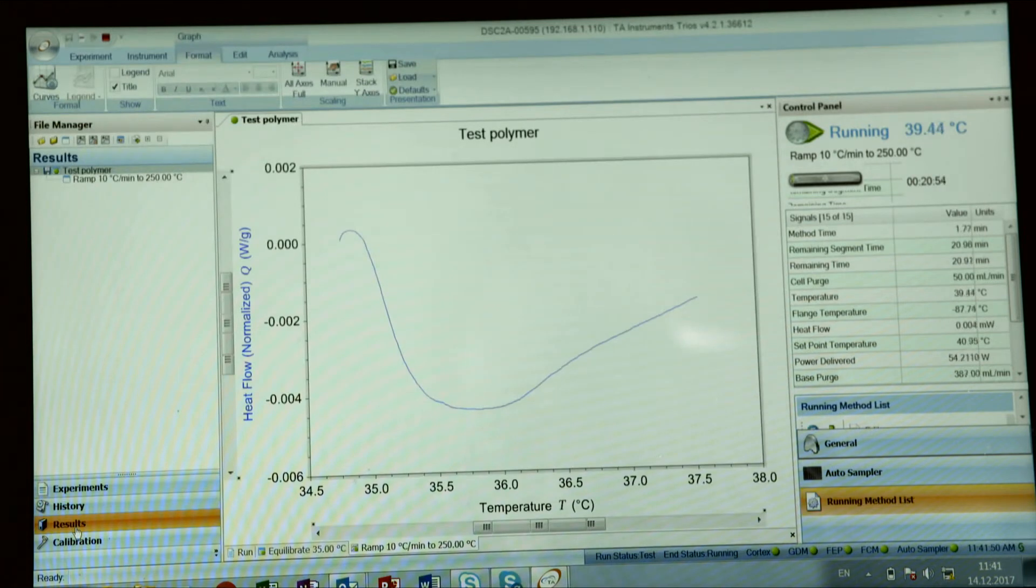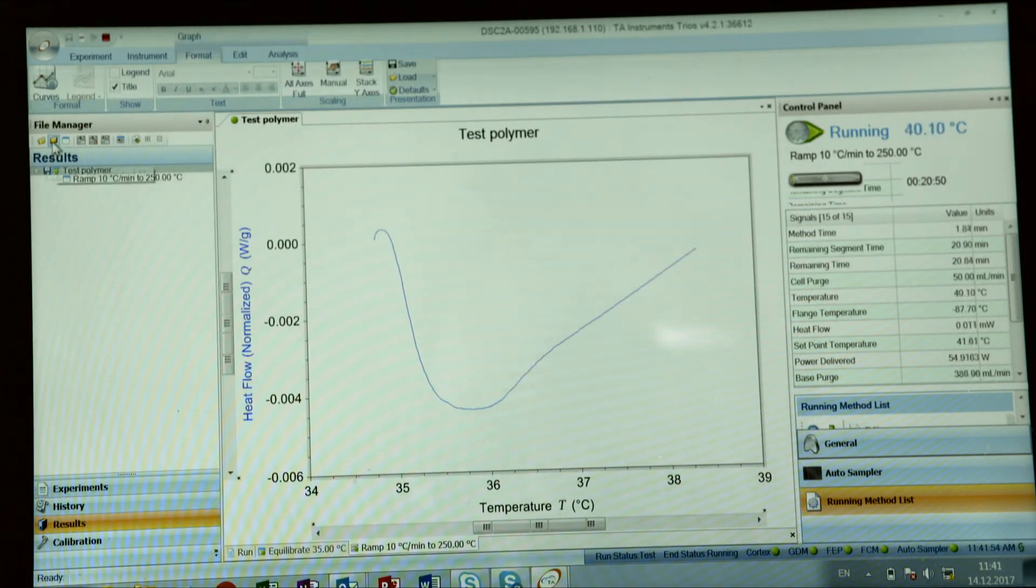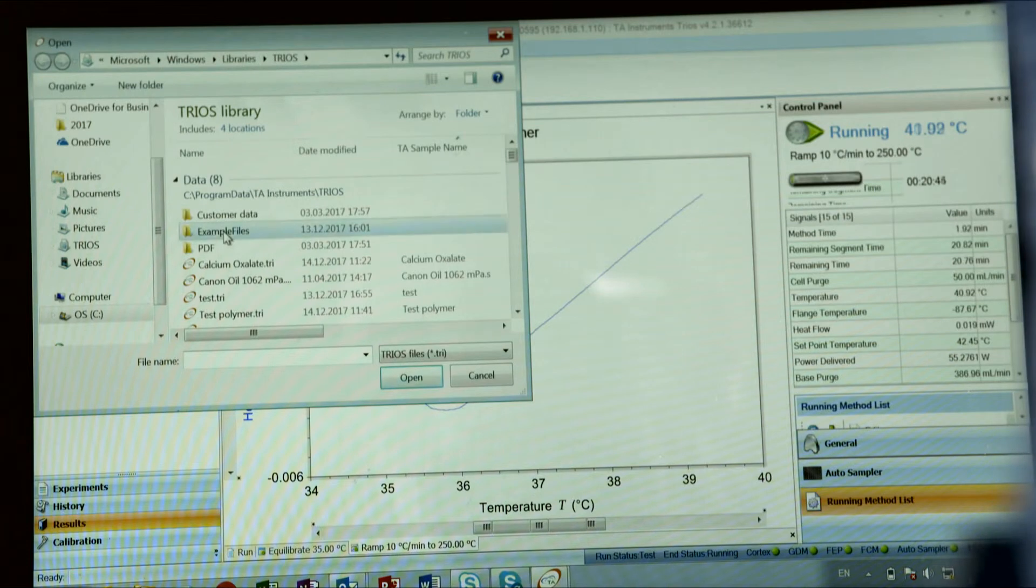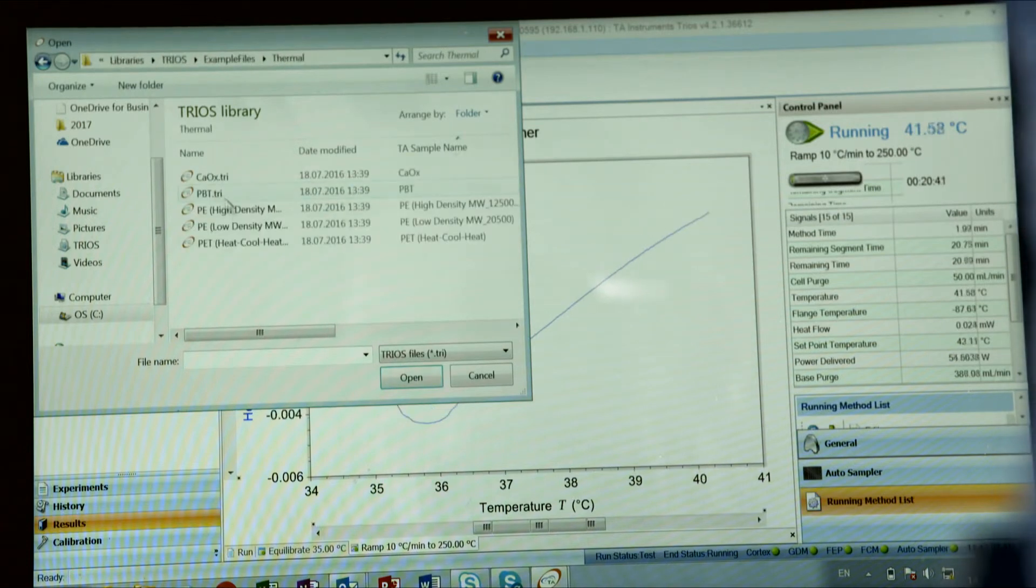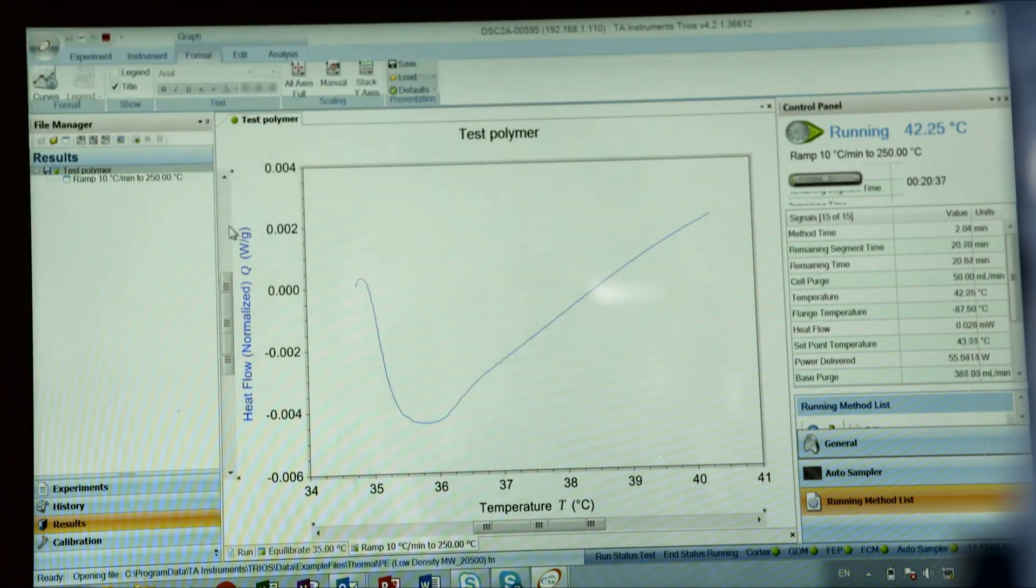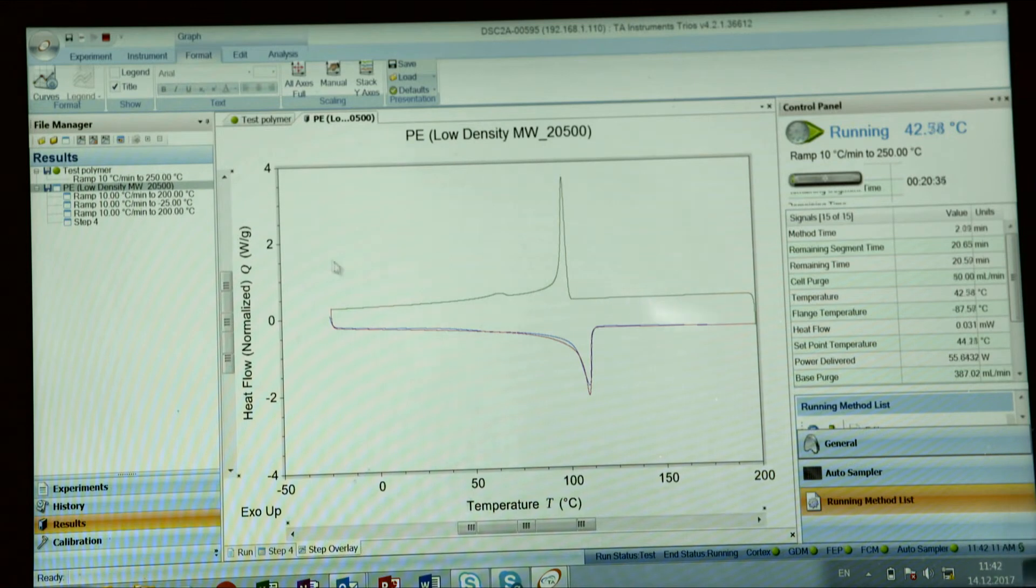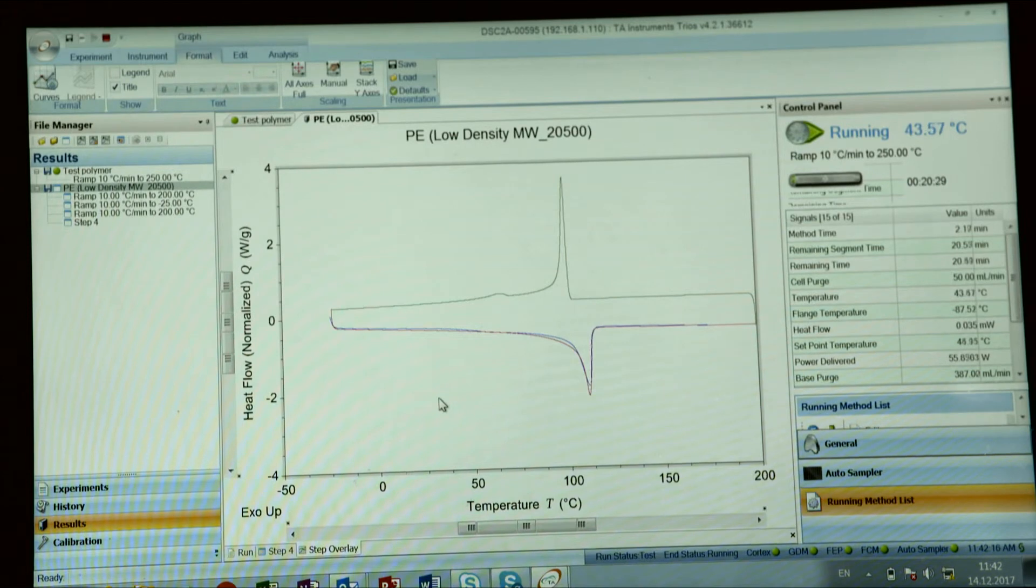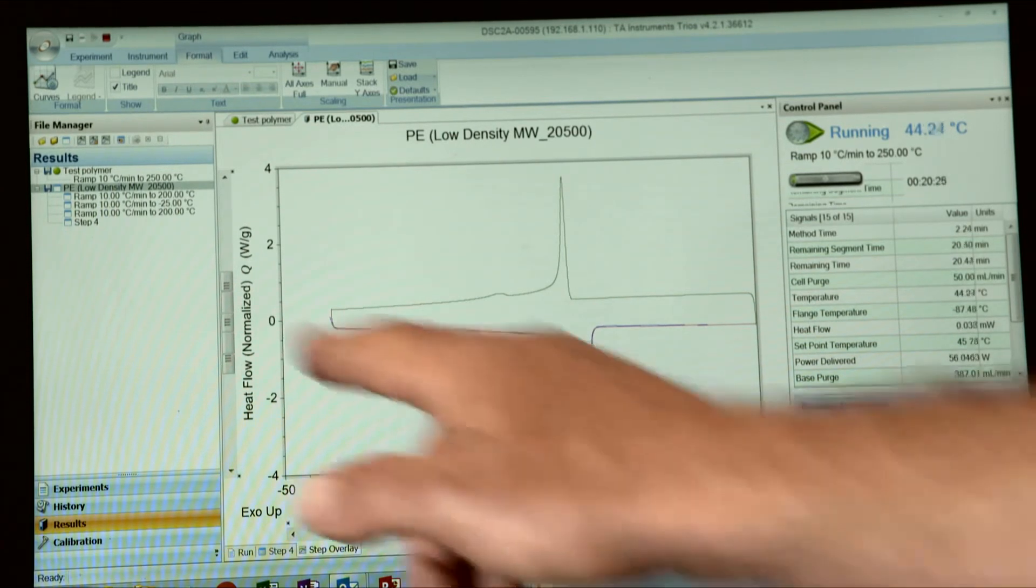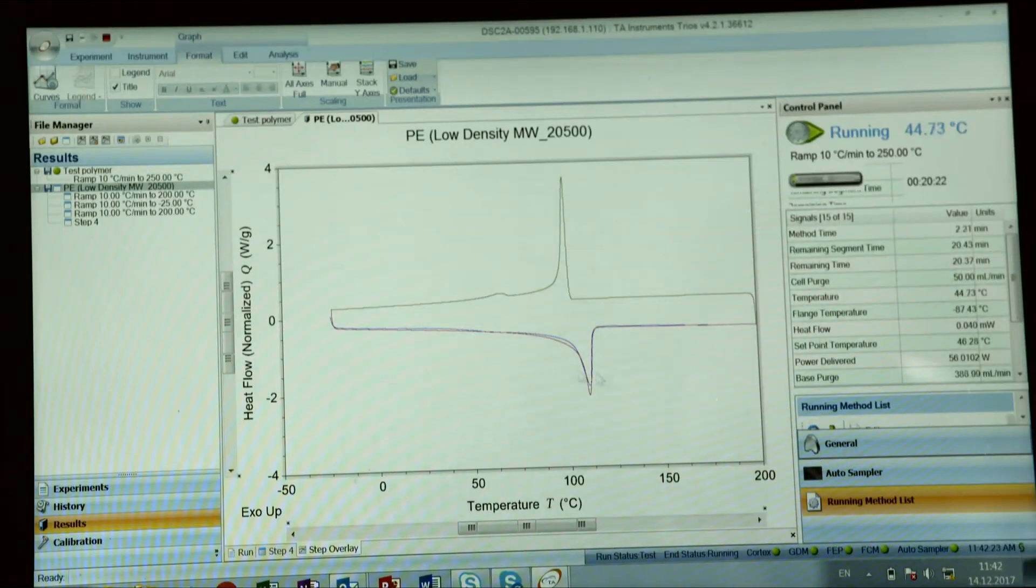Now, as a result, you will get some sort of curve. If we look at a typical DSC curve, this is a cyclic run of PE, low density PE. You can see it was heat, cool, heat curve.